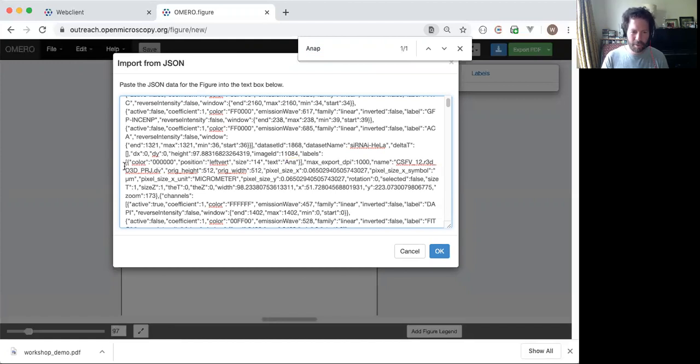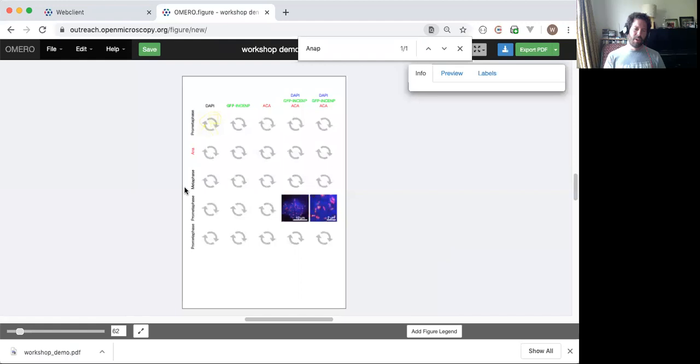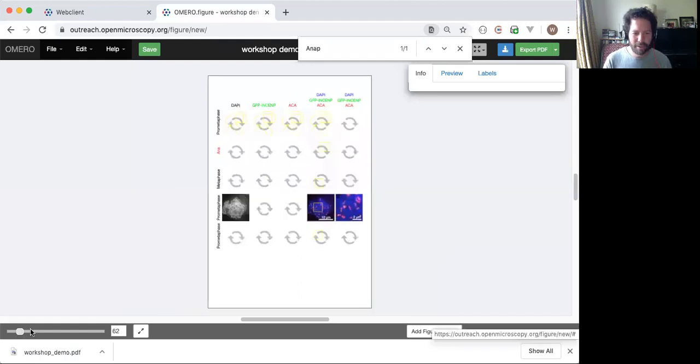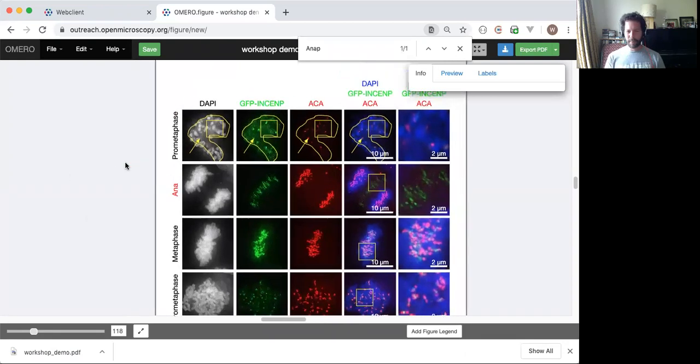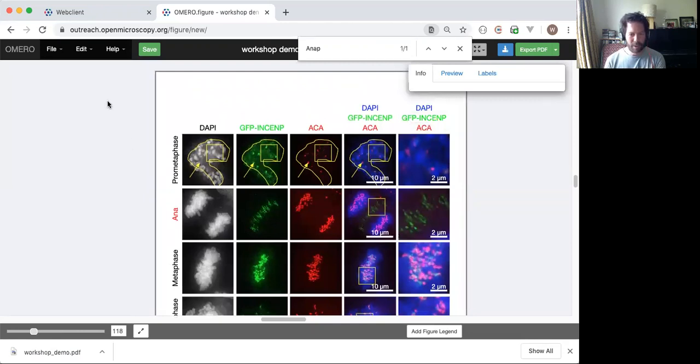You can also see in the same object here, there's some color. So let's edit that, and create the new figure from this data. I don't generally expect you to edit that JSON in this way, but what I'm trying to show here is that by manipulating the figure JSON, we can create a figure from that, and that's what we're going to do in a couple of other ways just now.